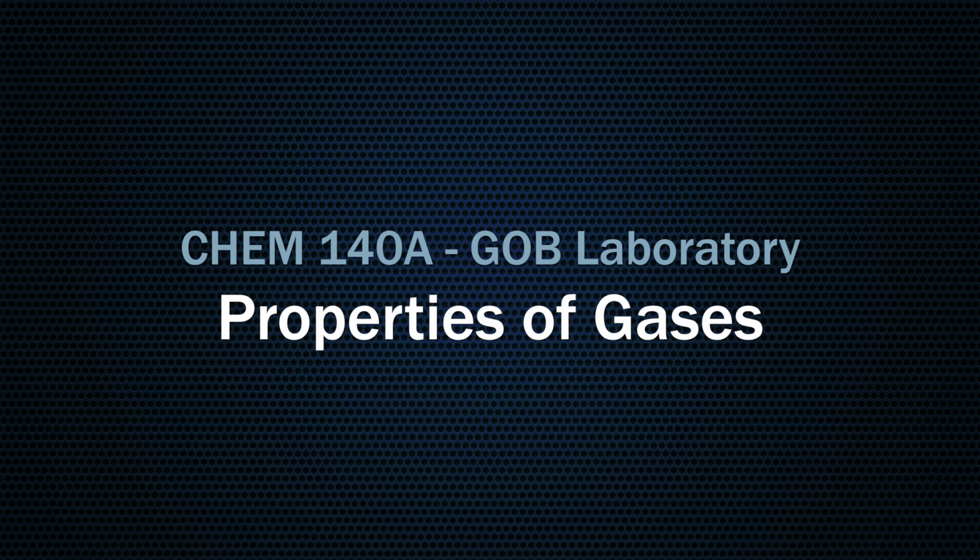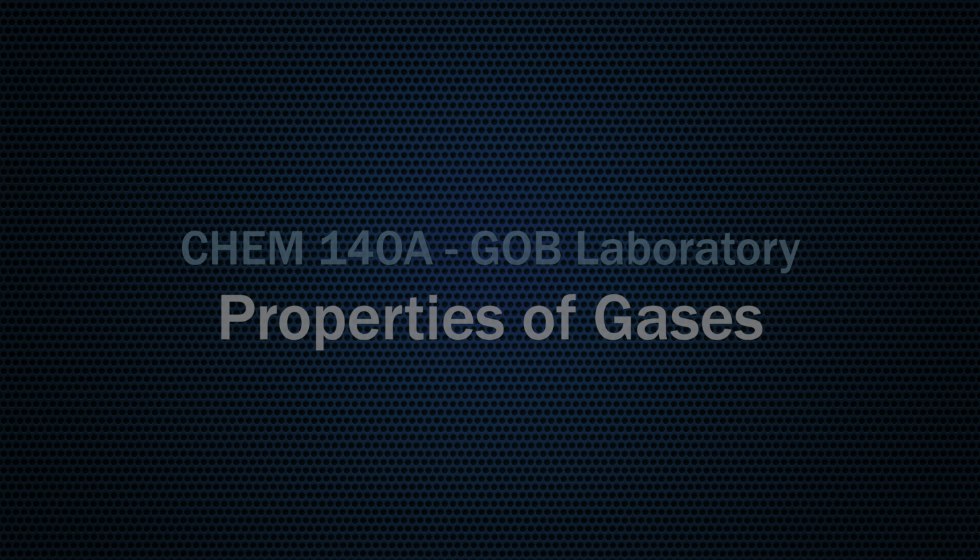Welcome to the GOB laboratory at Mercy College. In this experiment, we'll take a look at how gases respond to changes in volume and temperature.